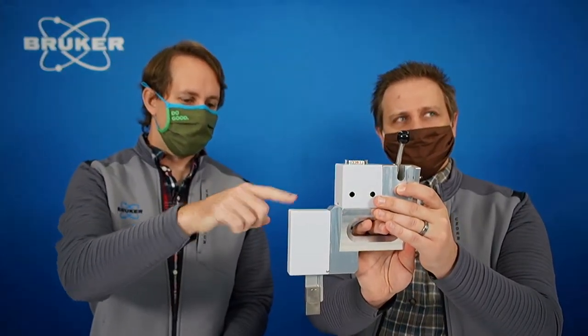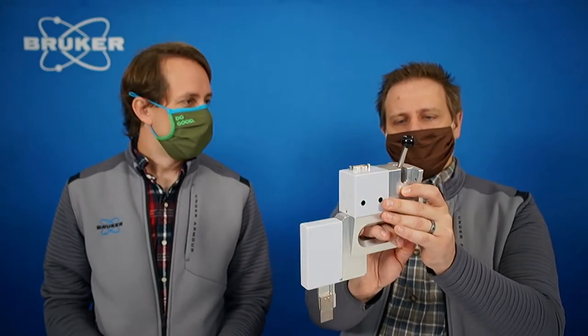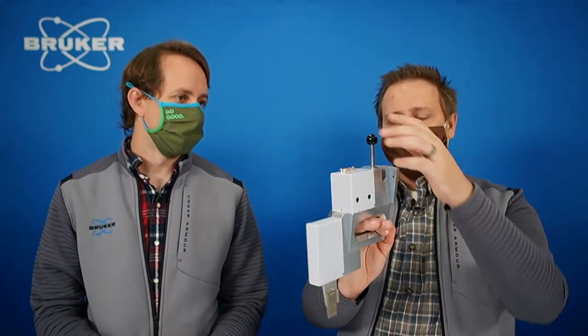All right, so welcome back here to the studio. We're going to look at a few of these components now. What we have here is our motorized air scatter screen, or what we call the MASS for short. There's a motor up here in this part, and that controls the height of this knife edge above your sample. What's this knob for? That's to mount the knife edge to the goniometer. So if you want to mount it, you just pop it up there. Exactly. It only takes a couple seconds to mount and dismount it.